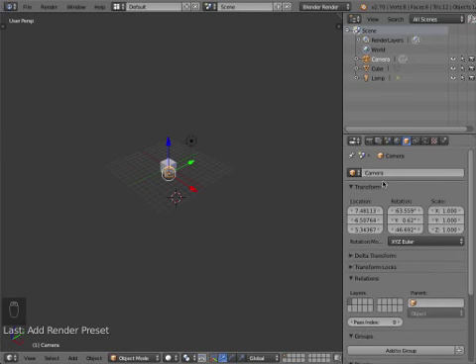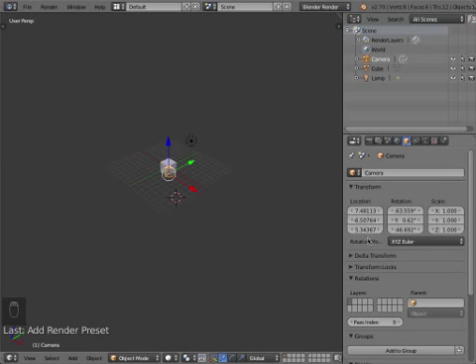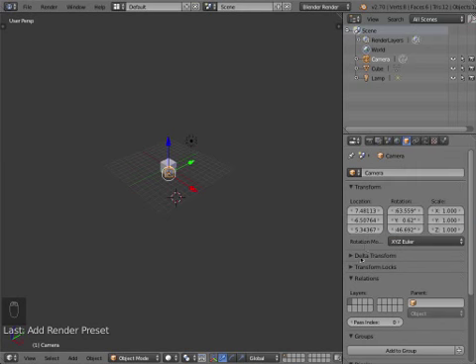Then here we've got the object data. The most important thing about the object data is, of course, the name. So name your objects in a sensible way, so that if you give your file to someone else, they can make sense of what the object name actually means. Then just the basic properties: location, rotation, scale of the objects in whatever mode you want to have it. Most people here, I think, like Euler. Mathematically, it's easiest to use quaternions or axis angle.